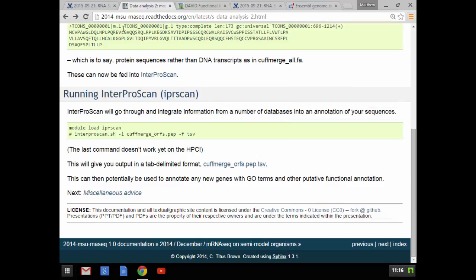You see the link up here. There's a read the docs link. You can start at that if you want to see what we taught a year ago and try to use that for any bits and pieces that I may have gotten wrong. There's a lot of stuff in there in terms of the copy and paste that I would not recommend copying and pasting when it involves the command line. I tried with a lot of the stuff that moved over with these new examples to make everything a little bit cleaner in your home directory so that everything stays in your example directory, everything runs appropriately, and all the data are available and don't end up wasting lots of extra time.